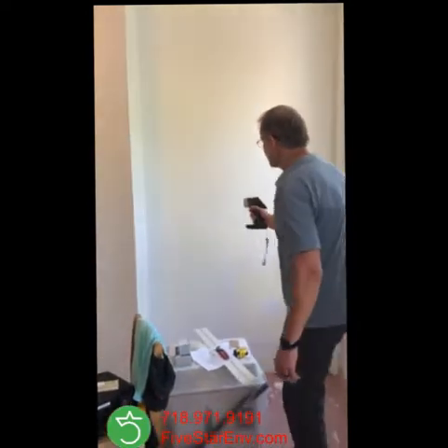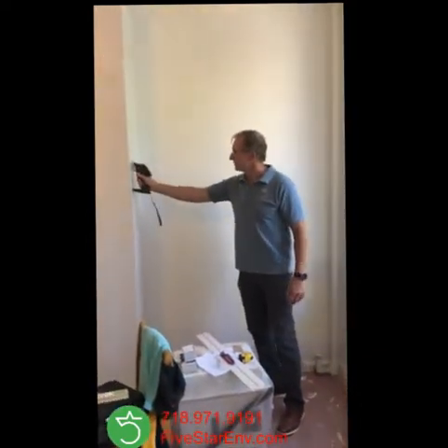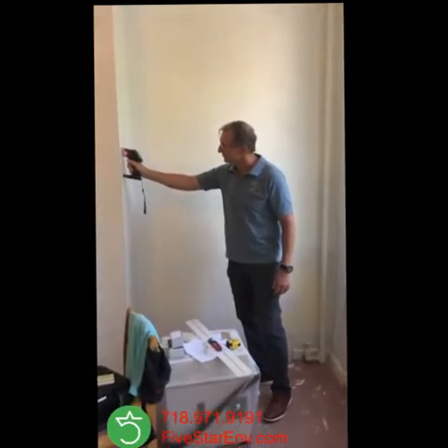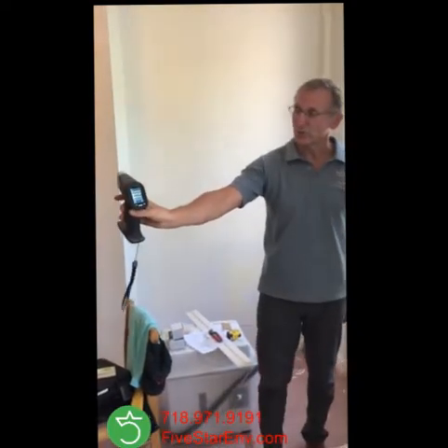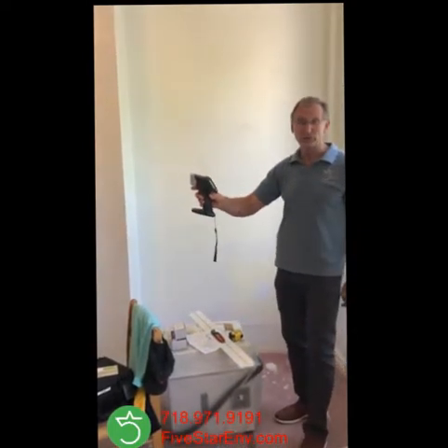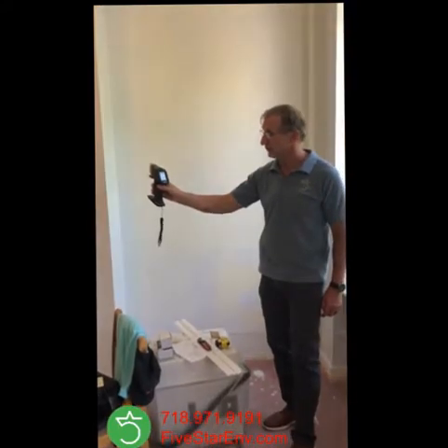Now that should be walls. When you do an inspection, you do a wall-to-wall inspection, but that's just for the sake of this presentation to show you how this works. I'm taking a reading right now. Here we go. This wall shows me 0.2 milligram per centimeter squared, which is a negative result. Results positive would be 1.0 and up, so we have a negative result.